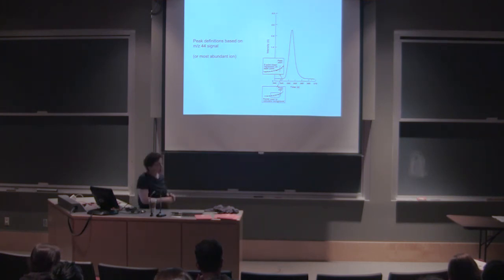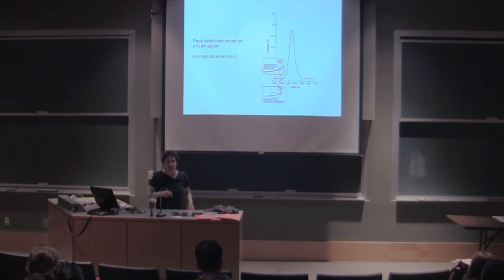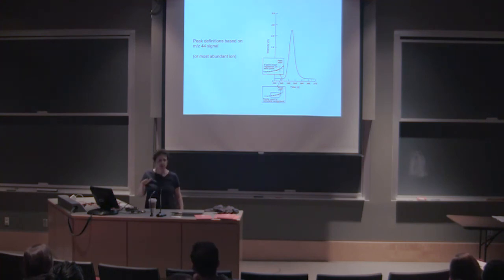And then the next part of this is involved in correcting the background, sort of subtracting background signal. And that's done, again, from backing up from before the peak and then doing some calculations of an average and then extending that across the peak itself. And there's a number of algorithms buried in your software on the commercial instruments. And it's like pulling teeth to get the company to tell you what they actually are. But they're all doing something similar to this.